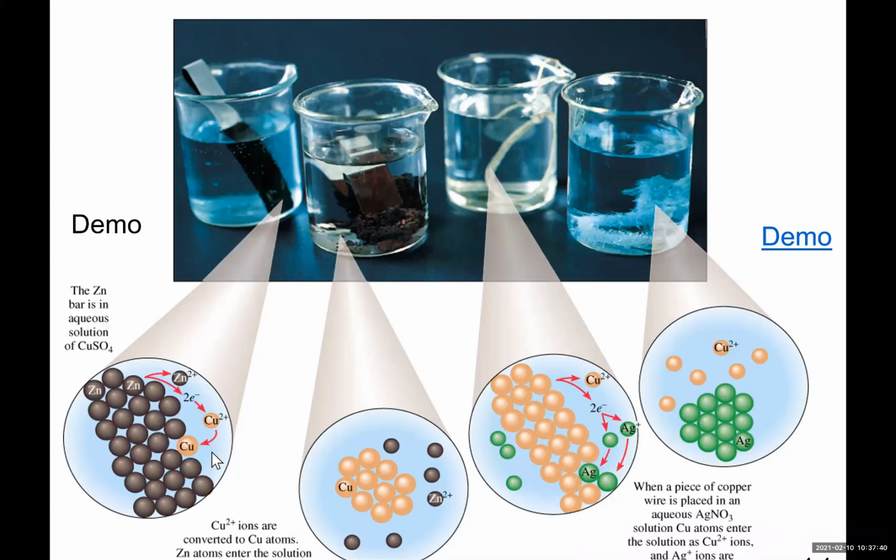So this reaction between Cu+2, the blue solution, and zinc metal is called a redox reaction, oxidation reduction reaction. What are oxidation reduction reactions? They are electron exchange reactions. Do you see zinc and Cu+2 are exchanging their electrons?